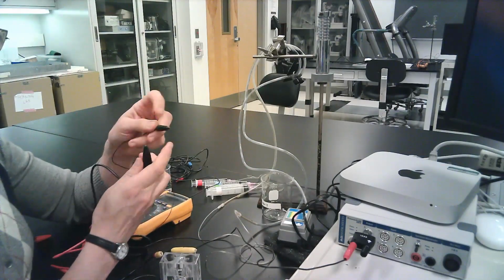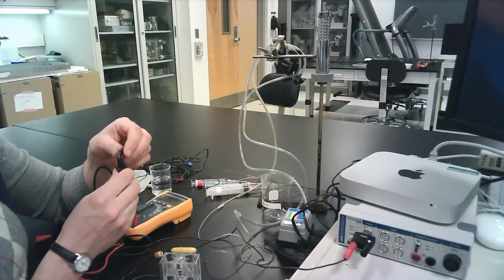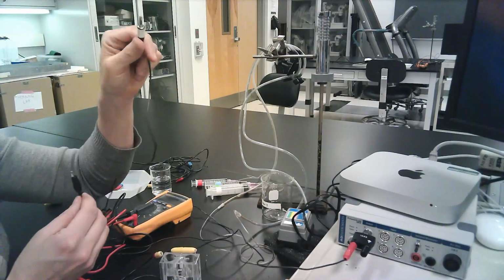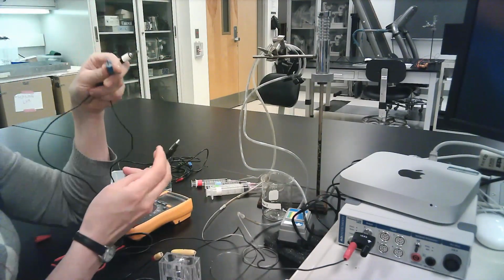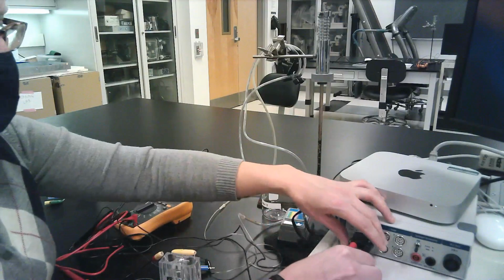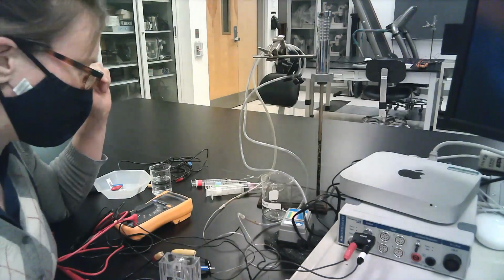So I will clip one end of this to the multimeter again, and then for the other end we're going to look for a black banana plug and a blue tip. We're going to connect up the other end of the alligator to the blue tip, and then we're going to run this black banana plug into the other part of the stimulator. And that's going to complete our stimulating circuit.